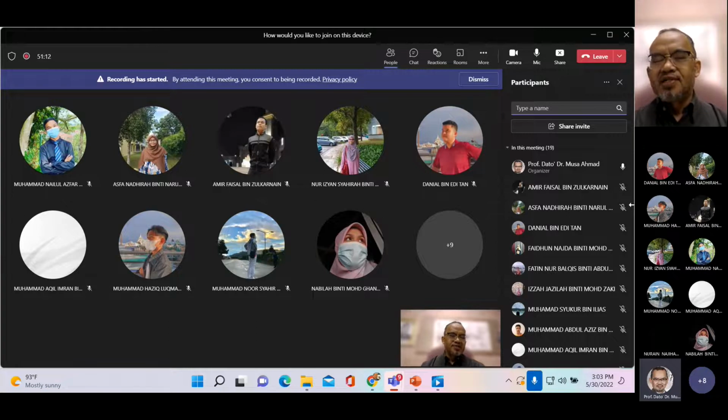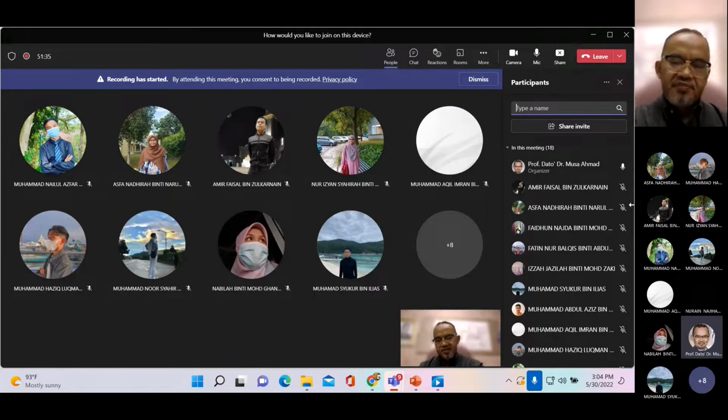But extrapolation actually is not really encouraged. We are not permitted to do that, because it's less ethical, because we don't know what happened beyond the concentration that we study. Interpolation is within the range, whereas here we're talking about a concentration higher than what we prepared for the calibration. So normally, you are not allowed in analysis to do extrapolation.